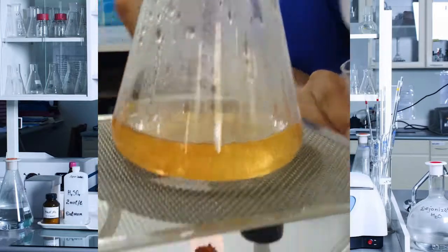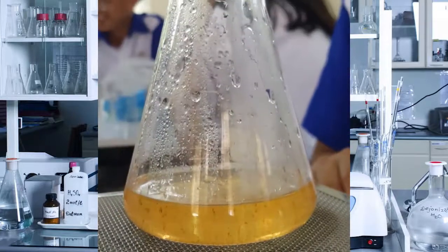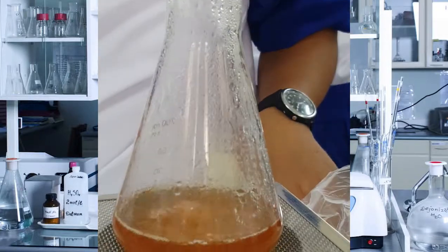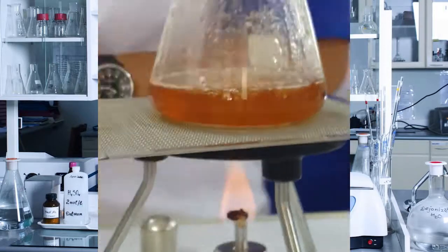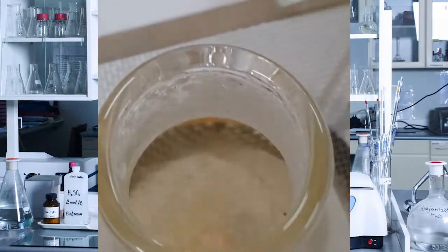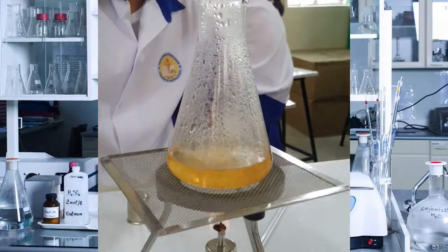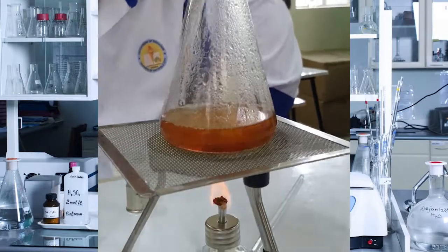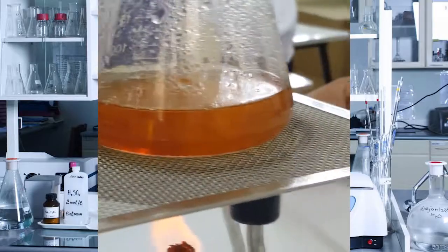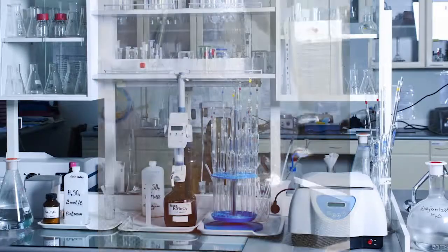As we observed, we can still see some particles of cinnamon in the water and it didn't form a new substance. We therefore conclude that this mixture had undergone a physical change and it is heterogeneous. Among the three types of mixture, it is considered a suspension because in terms of its visibility, the dispersed particles can be seen by the naked eye.